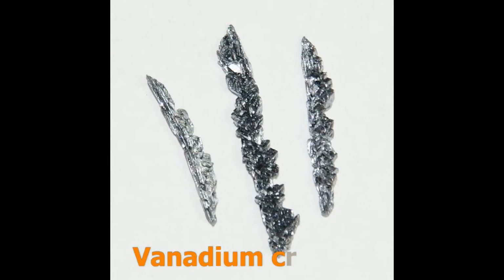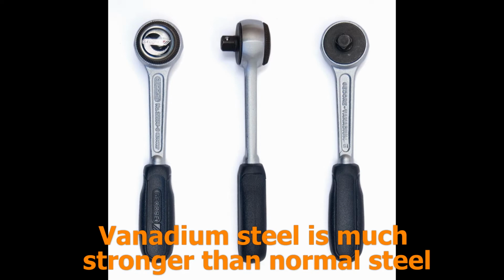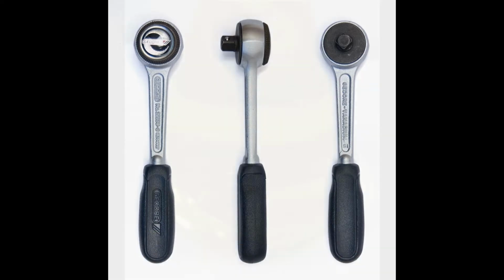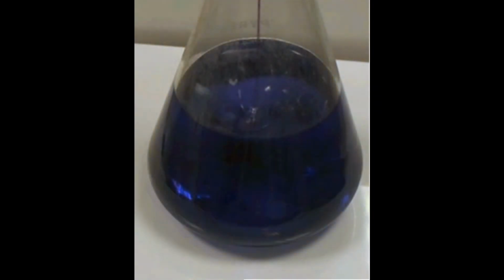Two of the most interesting examples are vanadium and manganese, which both have multiple stable oxidation states. First, vanadium. Vanadium is most commonly encountered in the laboratory as the 5+ vanadate ion. This is yellow. In this experiment, the vanadate has been reduced all the way down to vanadium 2+ to start with, using zinc. Vanadium 2+ is, as you can see, a rather attractive violet colour.